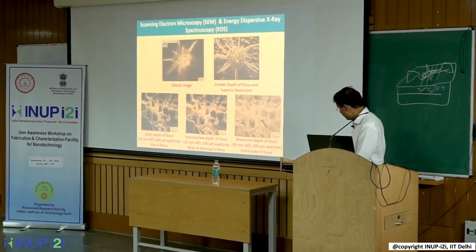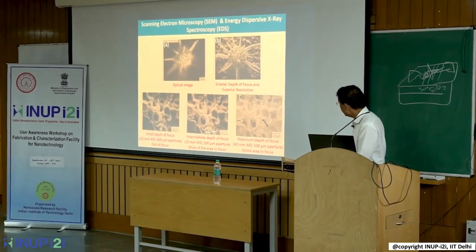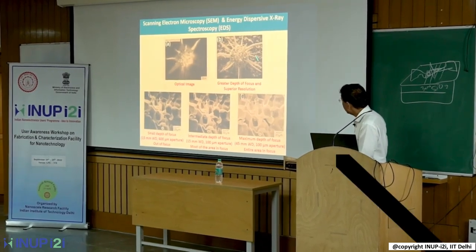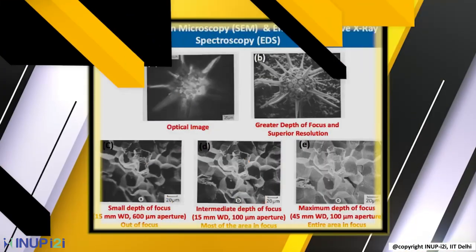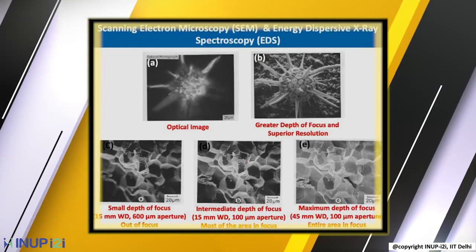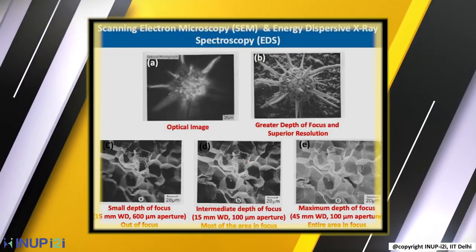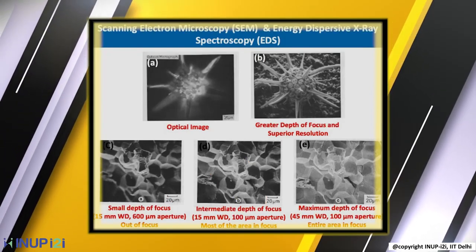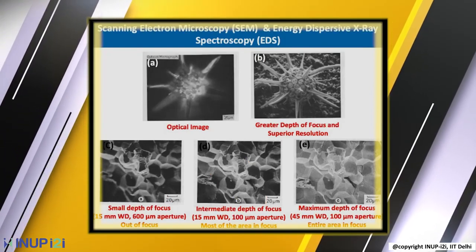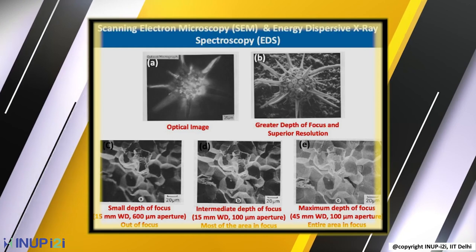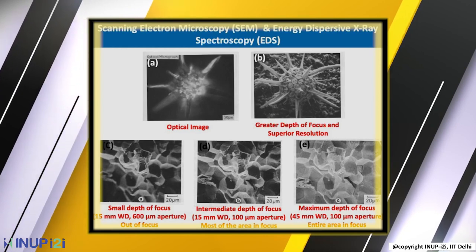Some pictures are shown here taken at different settings. This is the optical image and this is the SEM image. You can get much more detail in the SEM image.